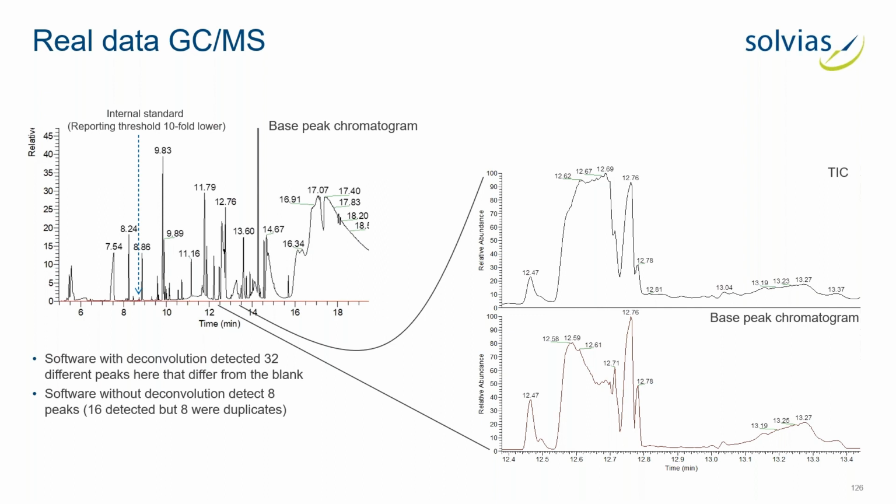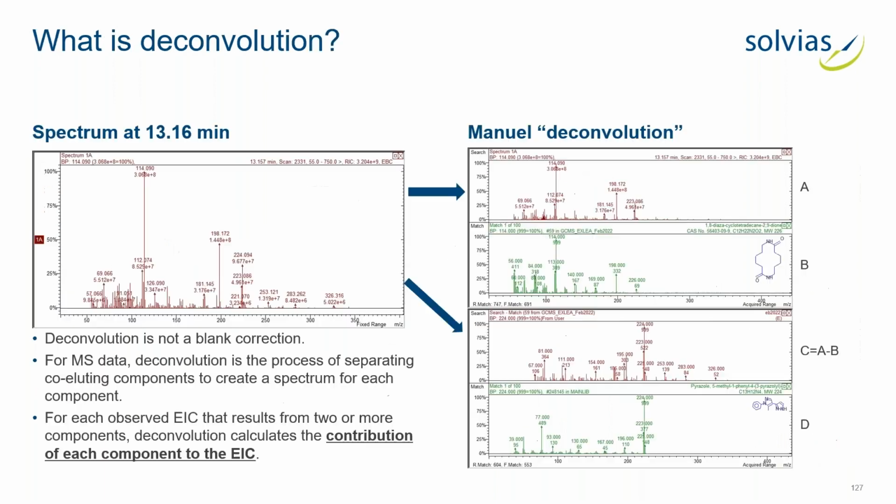We used data deconvolution software on it. And with the normal approach, we get 8 identified peaks out of it, if we want to be serious. With the automated data deconvolution, we get 32 out of it. And when you look, for example, at the chromatogram, you might see 8 peaks, but more or less there's a hill and another hill on it, and it's quite complicated to identify these kinds of things. But with the data deconvolution, we can do it.